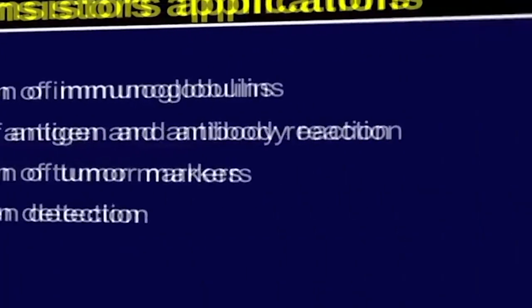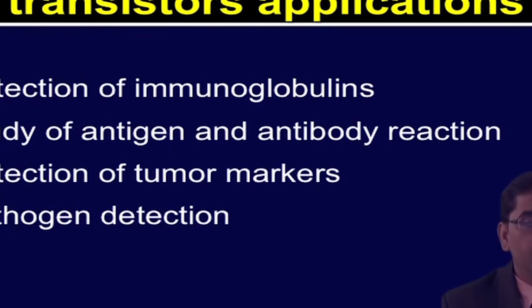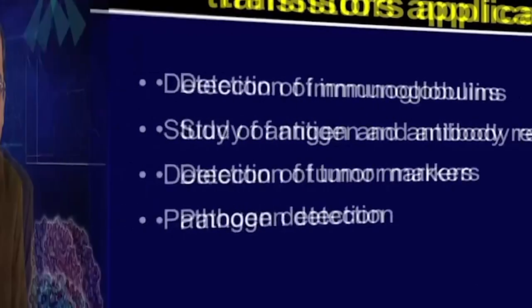There are many applications of CNT FETs. Here we will discuss it in context of proteomics. The platform has been applied for detection of immunoglobulins, study of antigen and antibody reactions, detection of various cancer biomarkers, and pathogen detection. One of the interesting topics to study these days is biodefense and how one can detect various pathogens which have potential of biohazard.